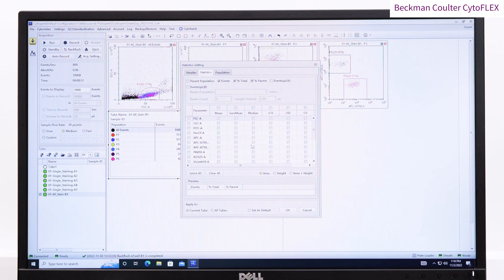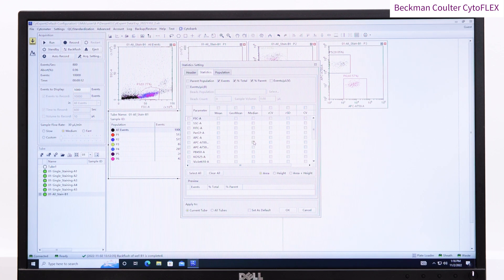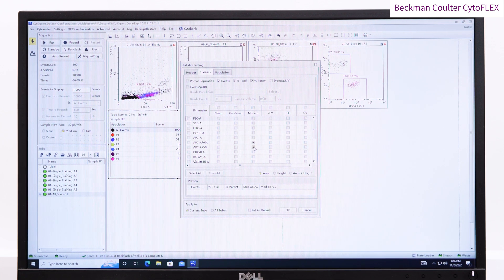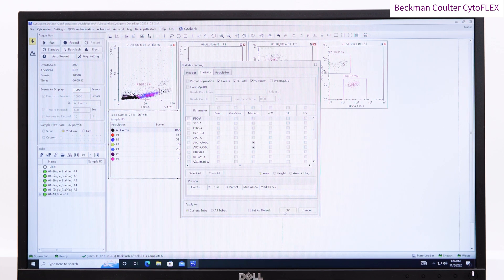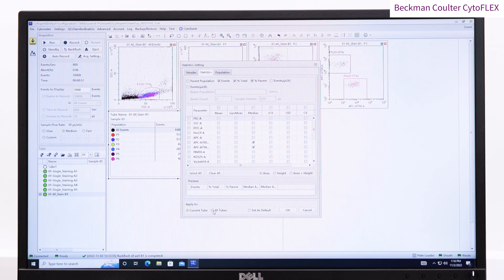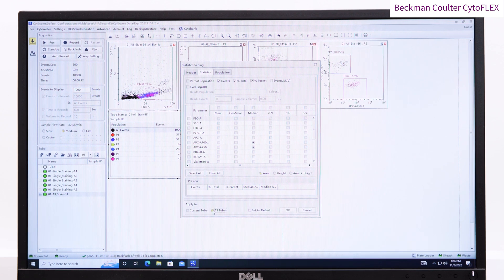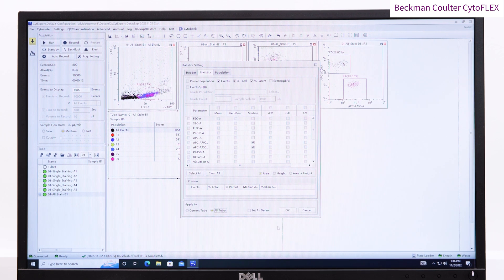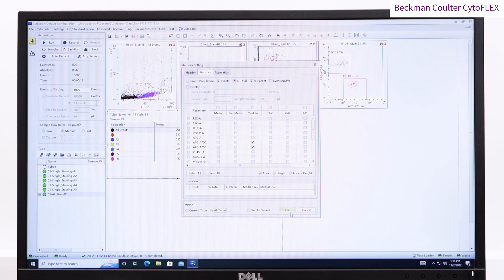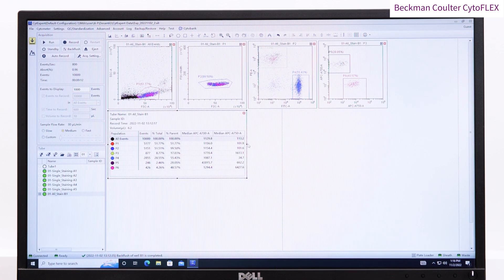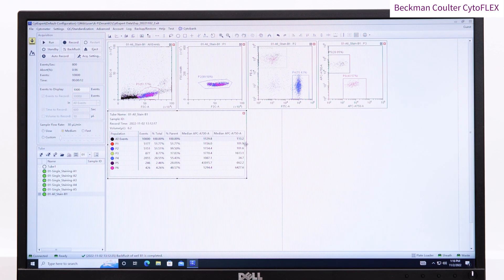The software automatically saves the FCS files into the same folder as the experiment was created. You can also export PDFs of the data through the print menu, and if you right-click on the statistics table, you can export all results as a CSV file.